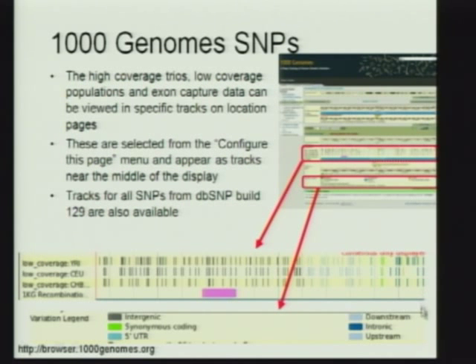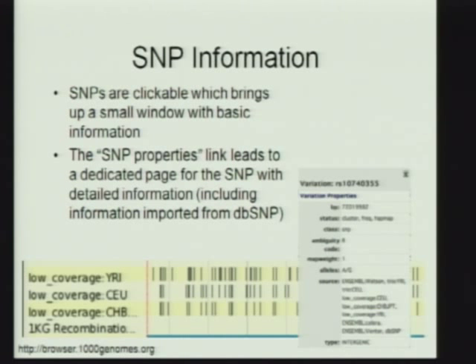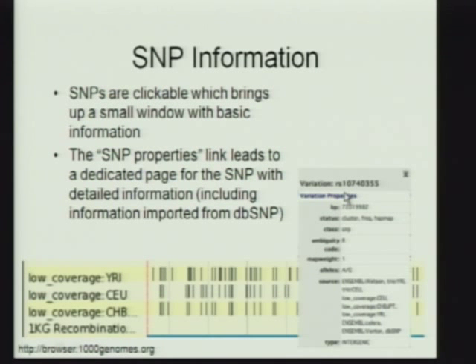The green SNPs here, which you can see right in this area, are synonymous coding SNPs — this is actually in a coding exon where those SNPs are located. All of the SNPs themselves are clickable and bring up additional information when you click on one of them. This is an example of the box that pops up — it tells you the location, provides additional information about where it was seen, for example in the low-coverage pilots. A link will take you to a main SNP page that contains information about the SNP properties; much of this information has been extracted from dbSNP.